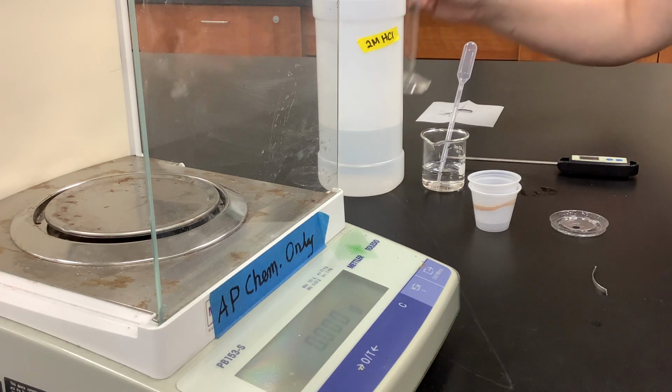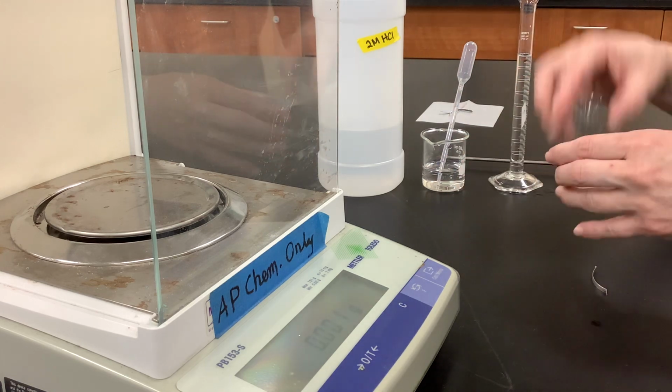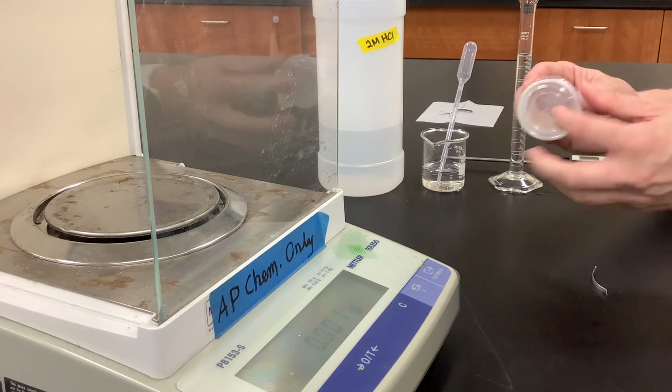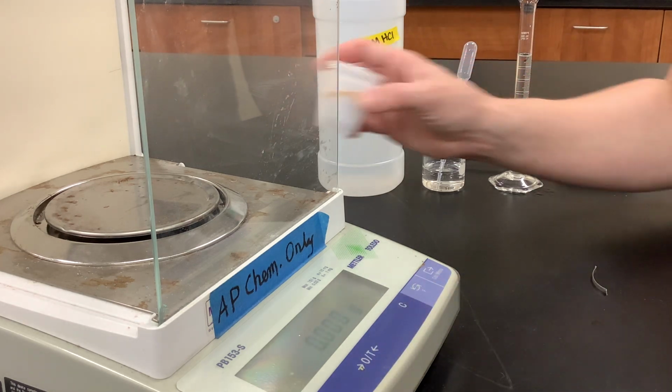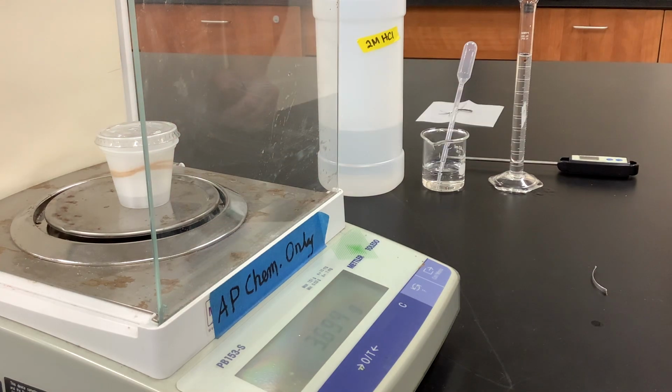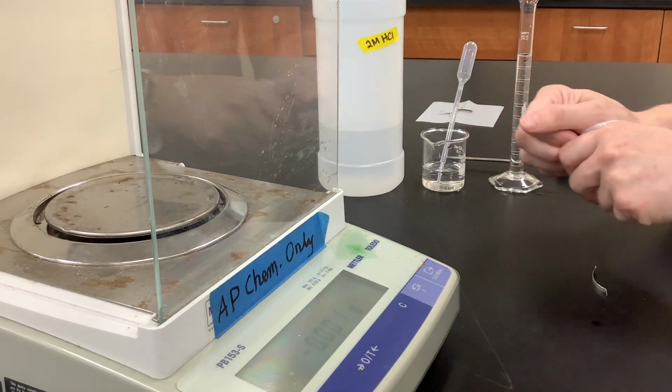Before I add this hydrochloric acid to my calorimeter, I'm first going to take the mass of the calorimeter, lid, and nested cups together. I need to record this. I'm going to put that on the scale. It looks like 3.683 grams is the mass of the calorimeter and lid by themselves.